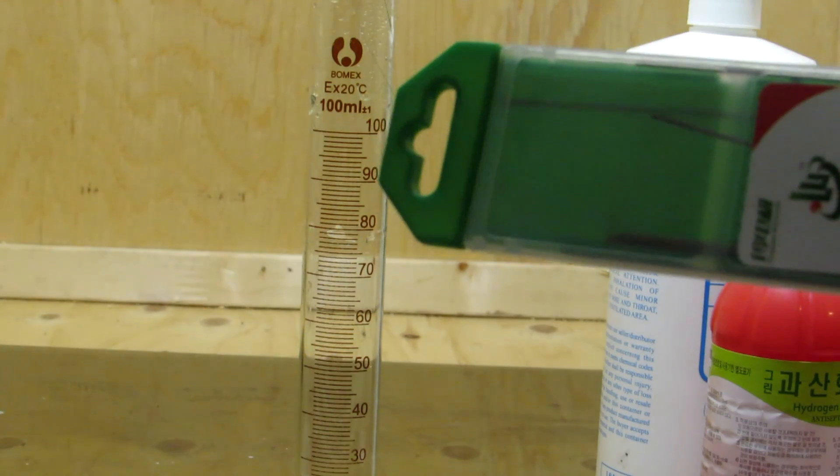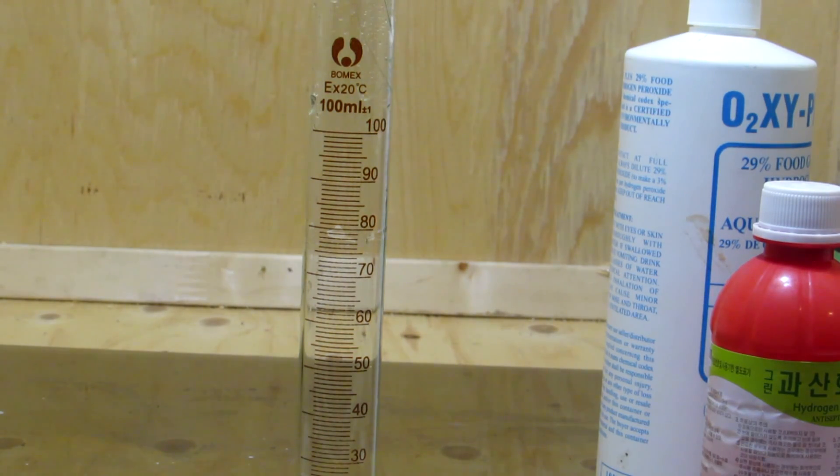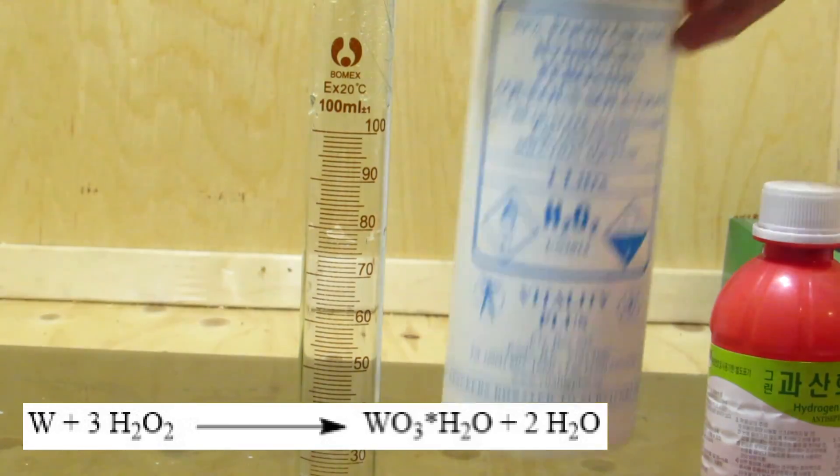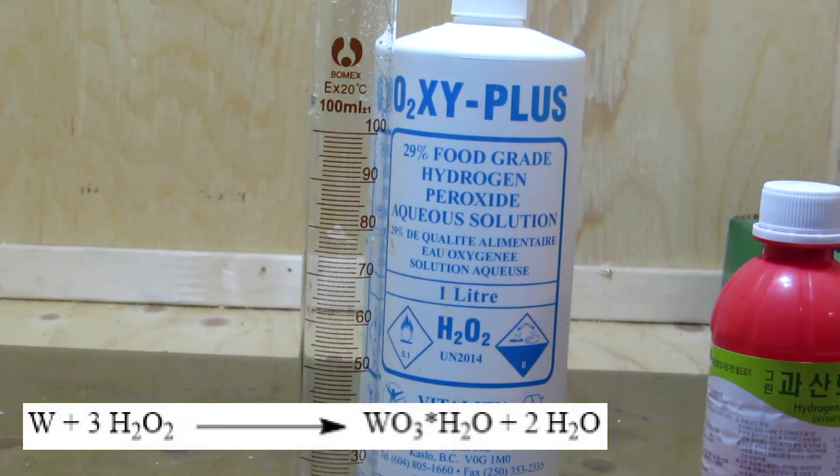These rods contain 98% tungsten and 2% thorium dioxide. Tungsten will dissolve in hydrogen peroxide to form tungstic acid, so the initial thought was to dissolve away the tungsten leaving the thorium dioxide.